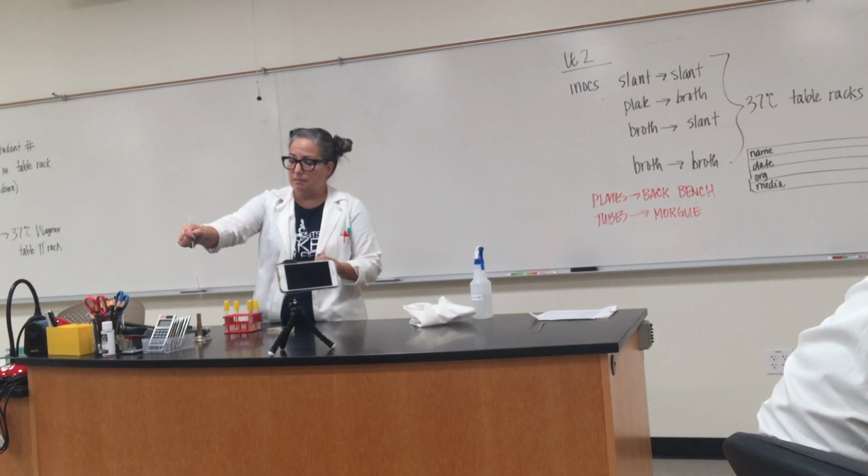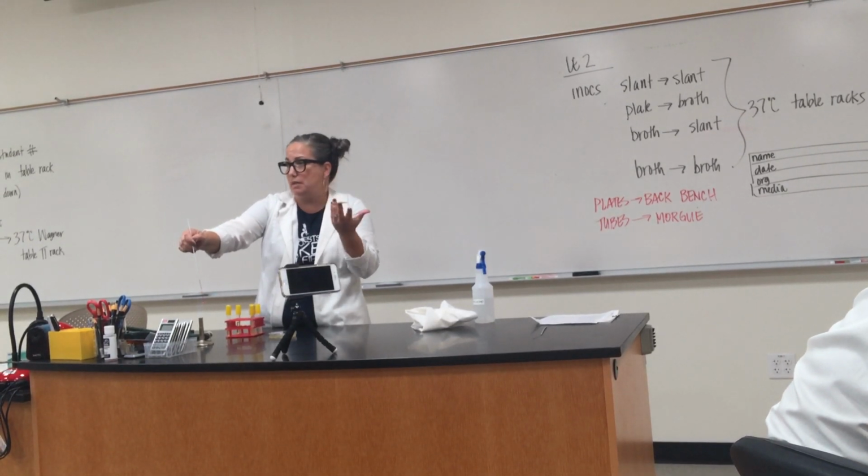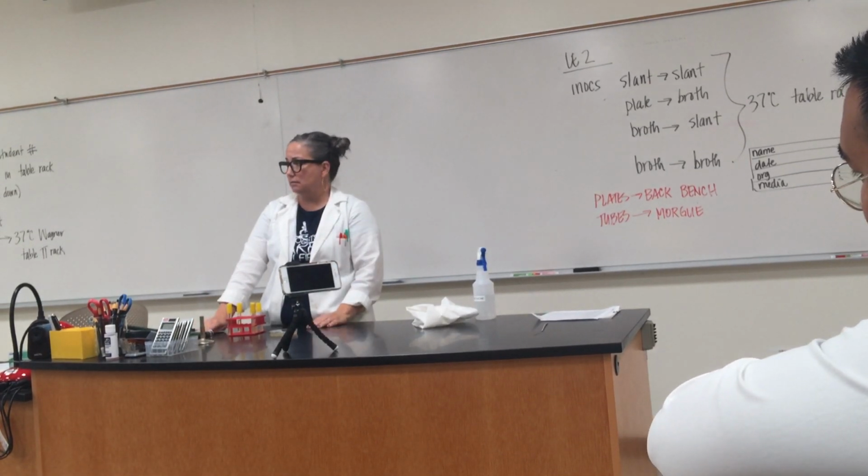And if you have organism on the end of the loop, it will actually make a little flame sometimes because it will ignite like a piece of wood. So you do that, sterile, done.